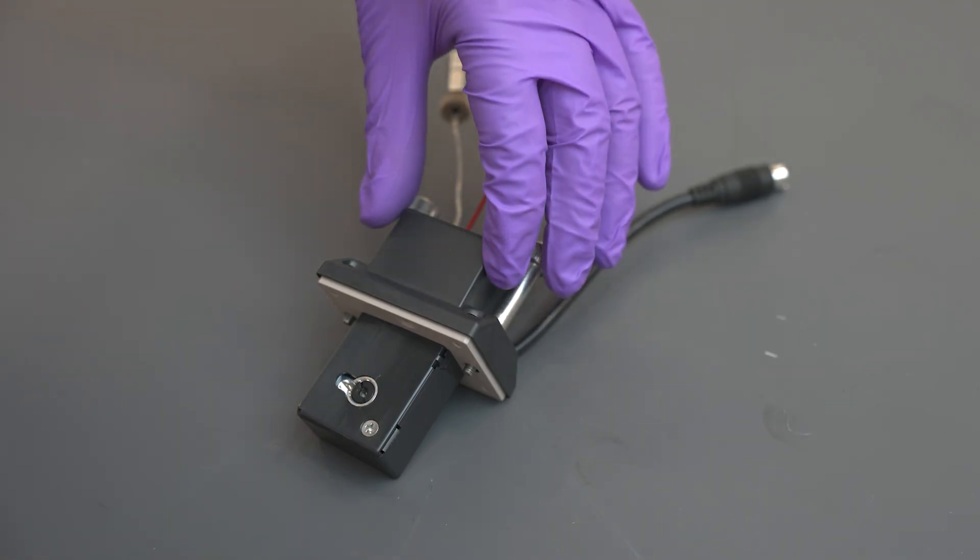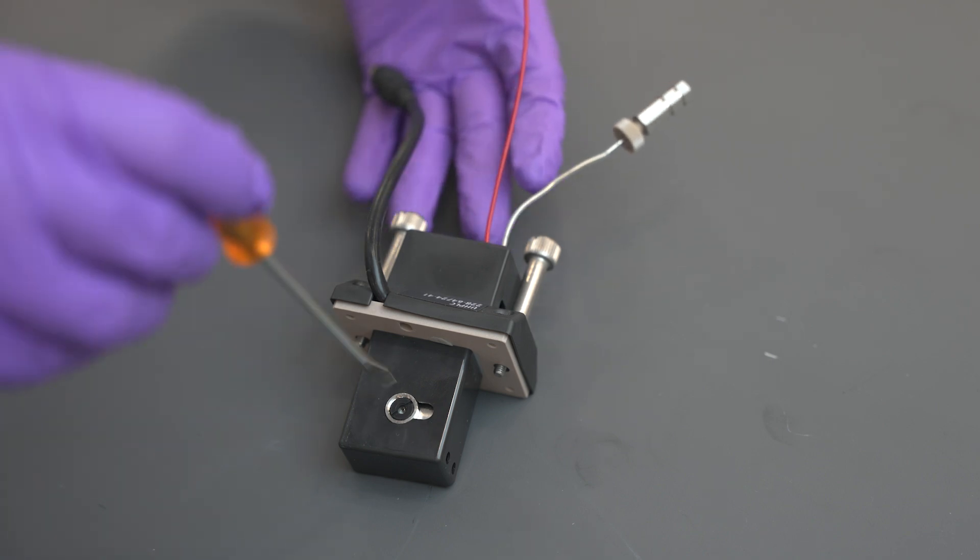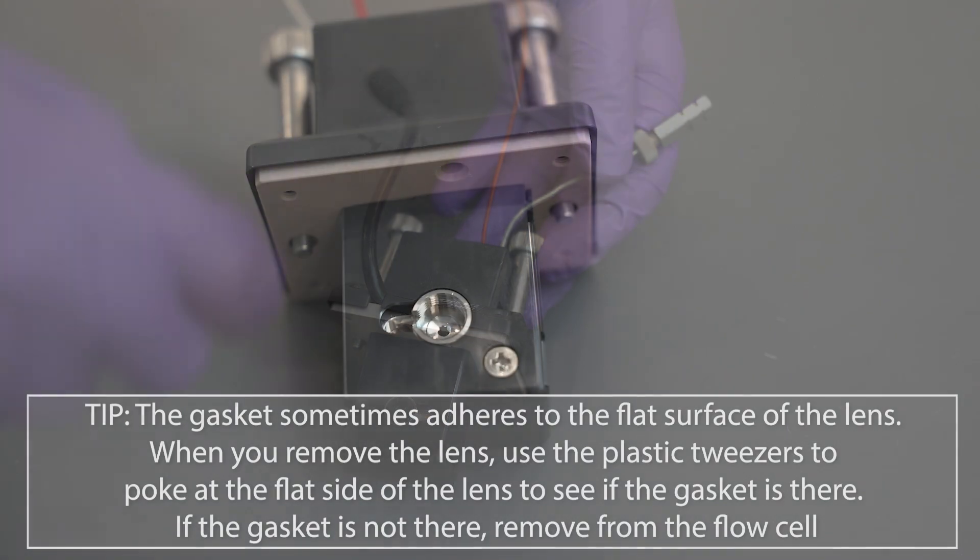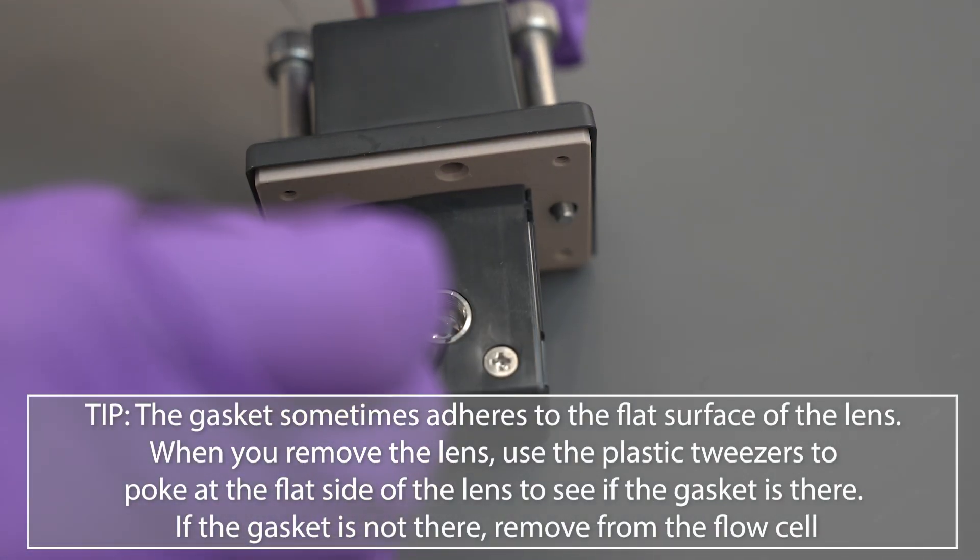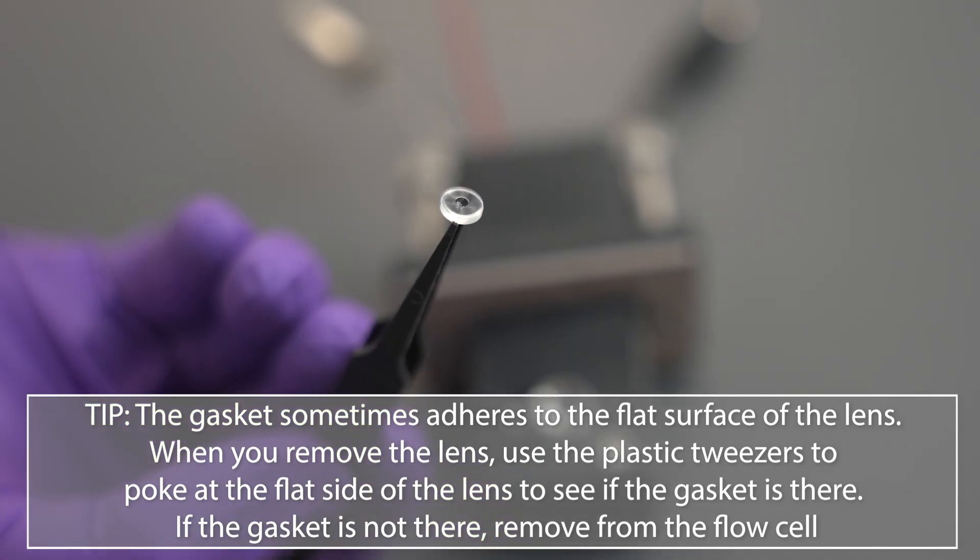Remove the left and right set screws using the flathead screwdriver. Take your plastic tweezers and carefully remove the lenses and gaskets. The gasket sometimes adheres to the flat surface of the lens. When you remove the lens, use the plastic tweezers to poke at the flat side of the lens to see if the gasket is there. If the gasket is not there, remove it from the flow cell.